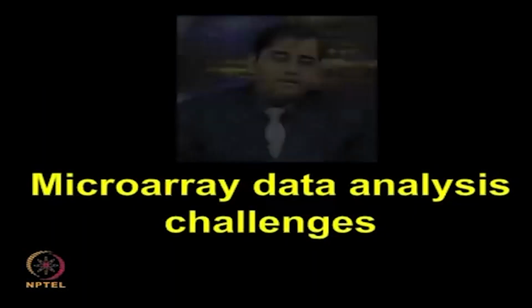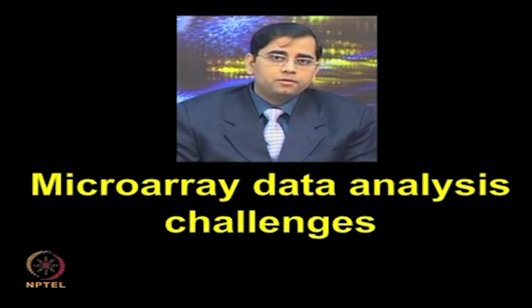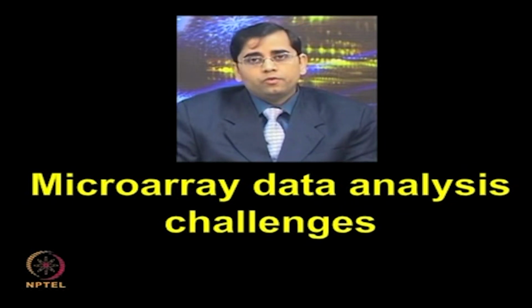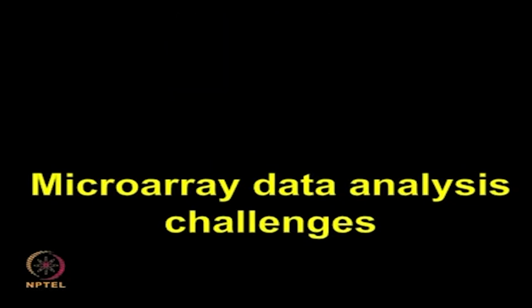So, now we have seen the overview of how protein microarray experiments can be performed. We have looked at various applications by employing cell-free expression based protein microarrays. We have discussed biomarker screening, immunological studies and protein-protein interactions. Now, regardless of what application you want to perform on these arrays, you are going to generate a large amount of data.